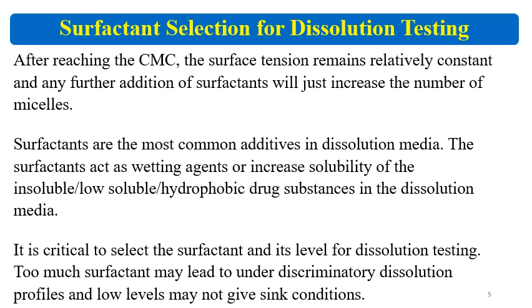It is critical to select the surfactant and its level for dissolution testing. Too much surfactant may lead to under-discriminatory dissolution profiles, and low levels may not give sink conditions. So there is a fine gap between the surfactant concentration, CMC and the sink condition.